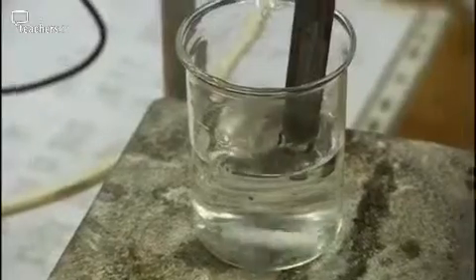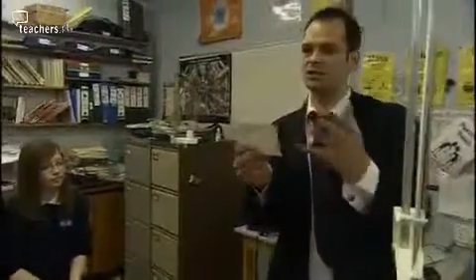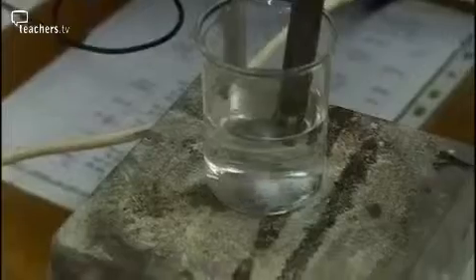Okay? Now I'm going to put it on the continuous mode so that we don't run out of time. Okay, so we've got a pH of around about 1.6, much more accurate than a pH scale. Because this will not only tell you what kind of colour it is, roughly what kind of pH it is. And what we're going to do is we're going to allow this to start dropping in, and we're going to start to produce the curve. Here we go.